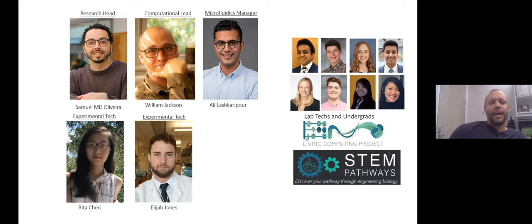The vision, though, on some level, is that the damp lab's day-to-day process is run by interchangeable undergraduate technicians. And I don't mean interchangeable in a derogatory way. I mean that in the best engineering sense, that the operations and protocols are standardized to the extent that someone that's trained relatively quickly can run these in a standardized, repeatable way.